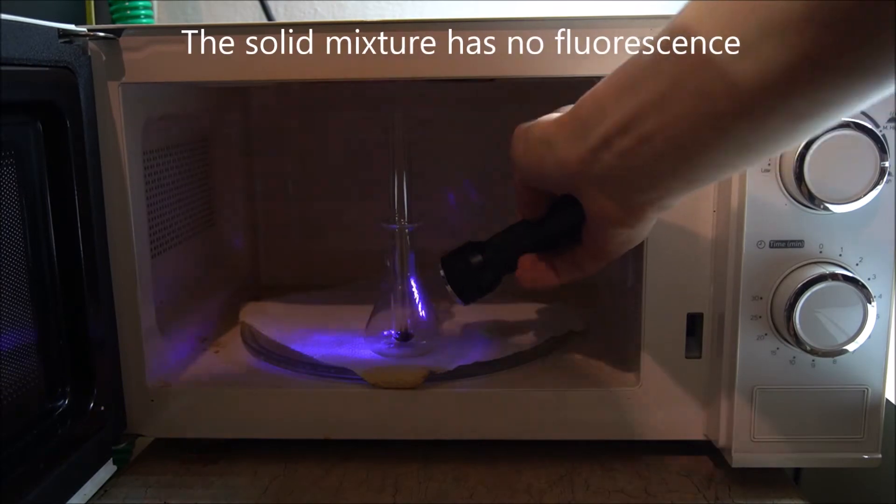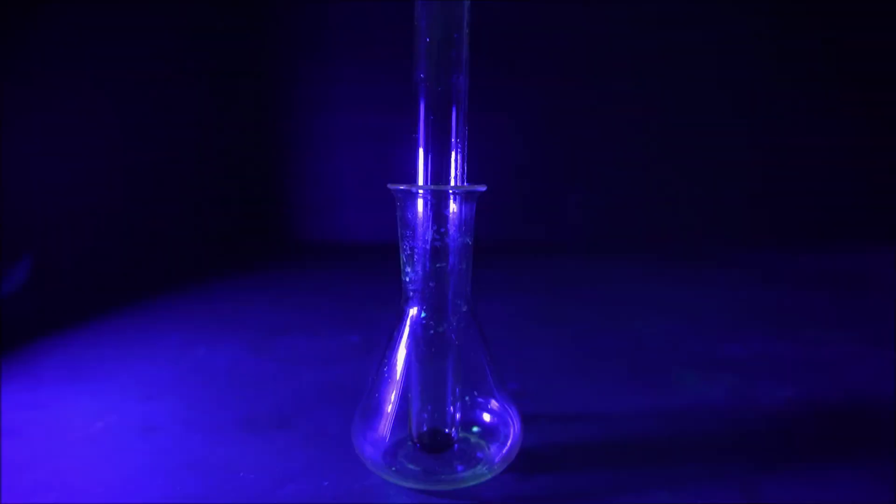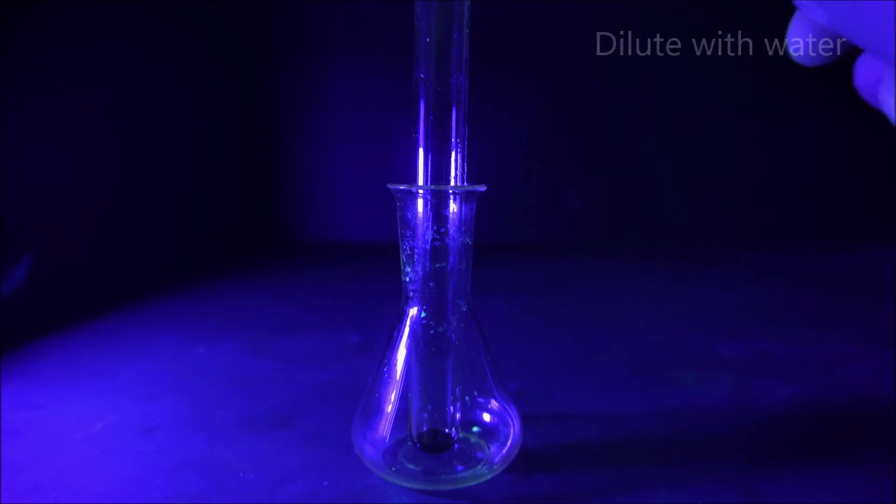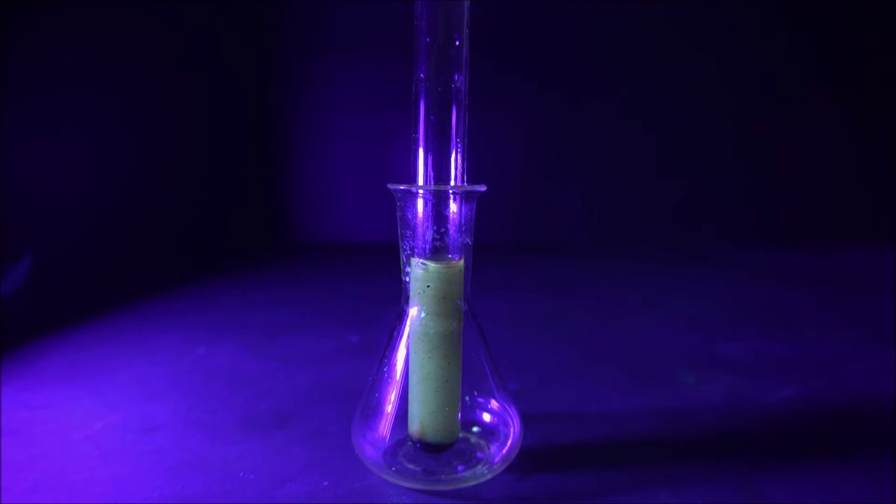The solid reaction mixture doesn't have any visible fluorescence. Add about 10 milliliters of deionized water to the test tube. The fluorescence appears to be yellow or green depending on the angle of illumination.